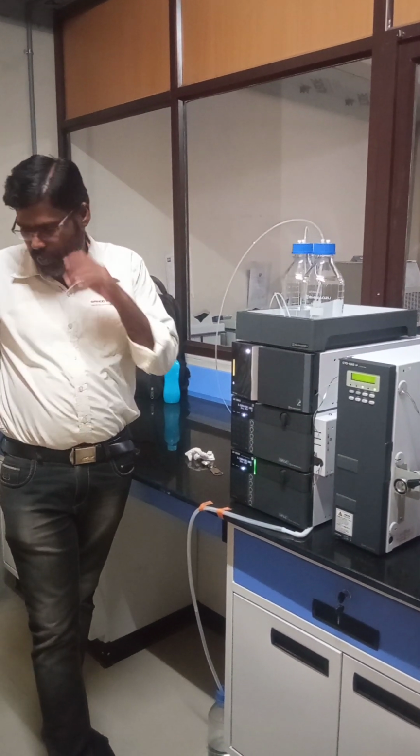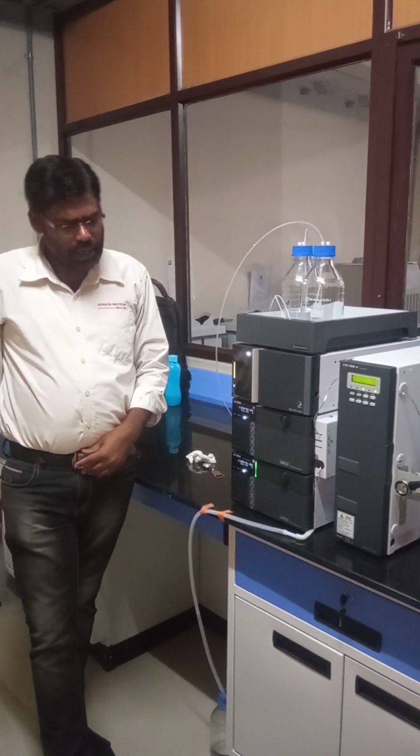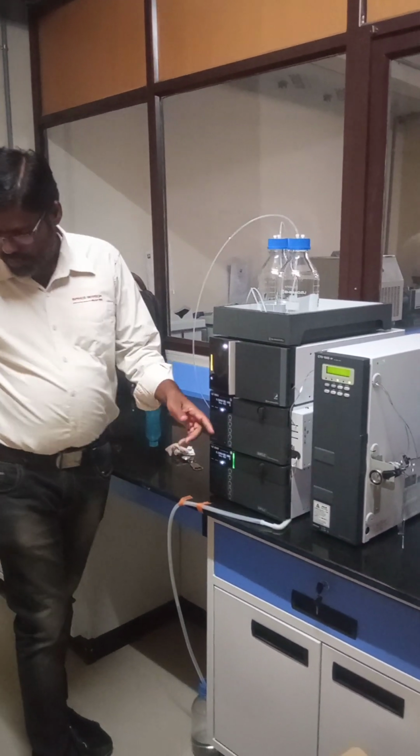Tomorrow, based on your sample, you have to select what mobile phase A is, what mobile phase B is, and what the flow rate is. We can change the flow rate also; I will show you through the software. Up to this level, then open the purge valve. Next step.